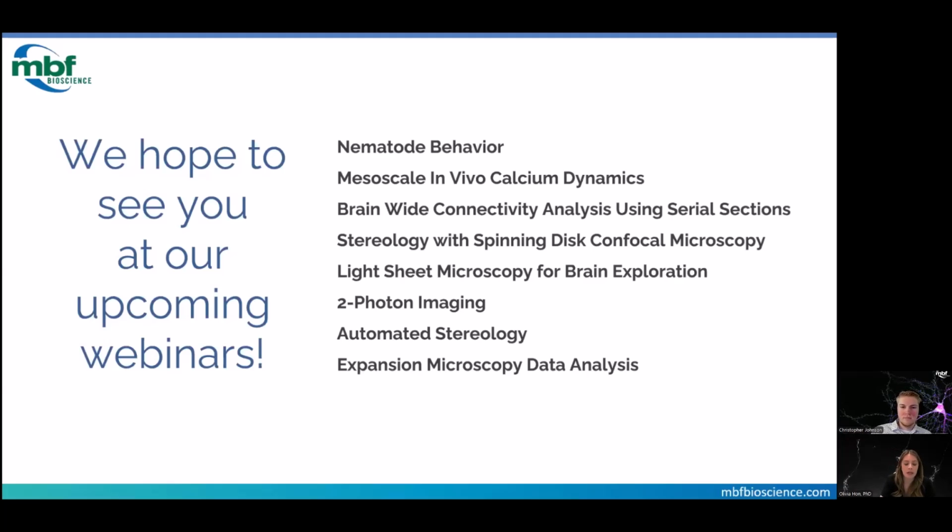That's a good question. What we've seen is that the noise gets much smaller on both the rising and the falling edge. So there's probably a way to tweak the workflow where it's looking for the transition from low noise to high. We haven't tested it yet, but I think it's possible. Also, we found that with smaller window sizes, it can pick up the beginning and the tail, and not the very middle of the peak, if the window is smaller than your peak duration. And so if you add a little bit more logic there, you can say, make sure the slope is negative, so it's decreasing, not increasing. So you can isolate those out.